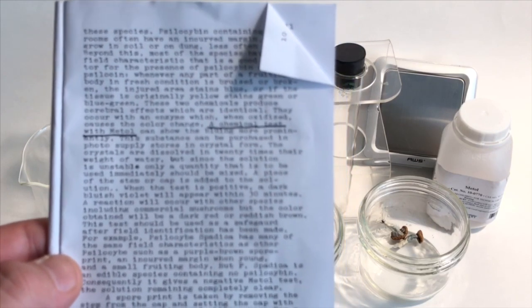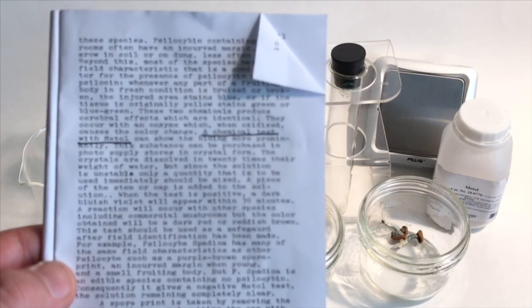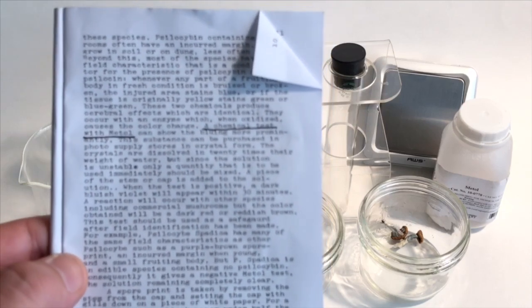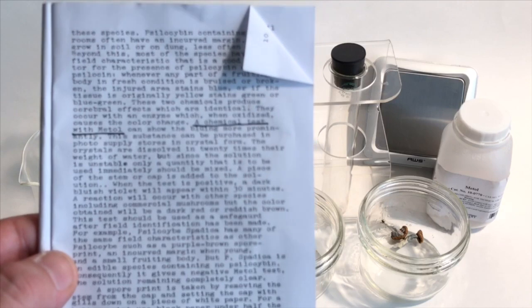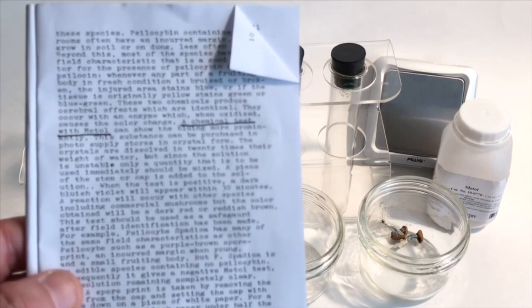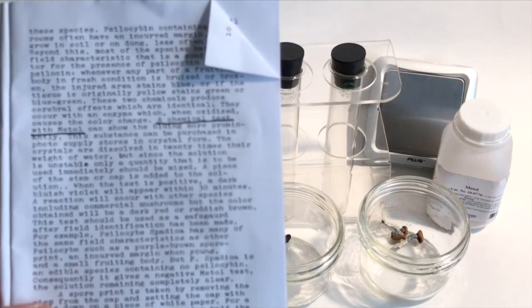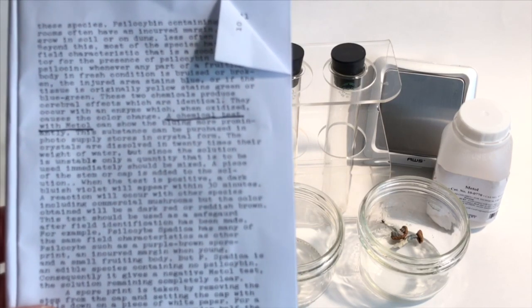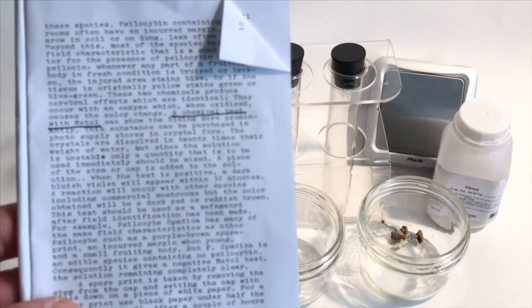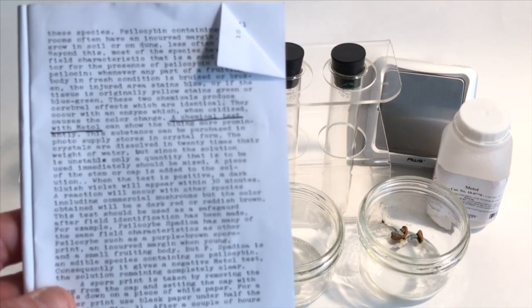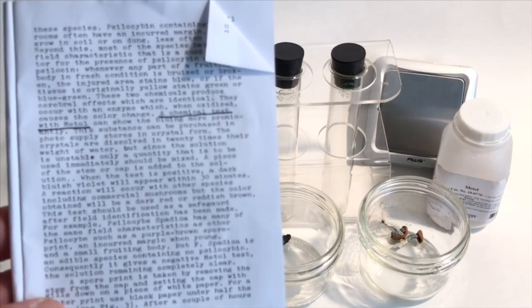For example, Psilocybe spadica has many of the same field characteristics as other Psilocybe, such as purple-brown spore print, an incurved margin, and when young, a small fruiting body. But spadica is an edible species containing no psilocybin. Consequently, it gives a negative metol test, the solution remaining completely clear.